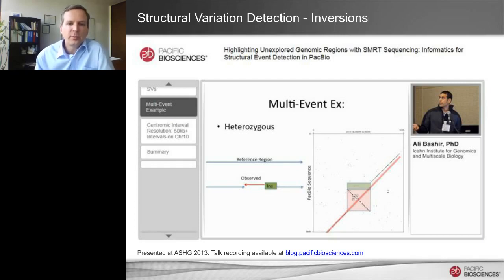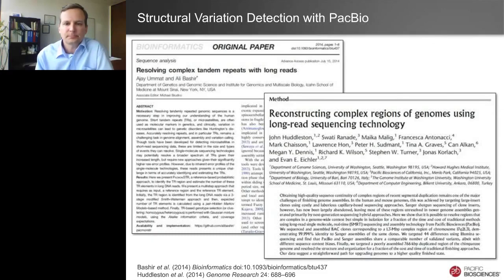And so that will make the effort using the short-read technologies futile, because they will not have any reads that have any breakpoints and junctions. And even the PCR validation, where you design a primer downstream or upstream of this region, will have the wrong size and will not give you the validation.